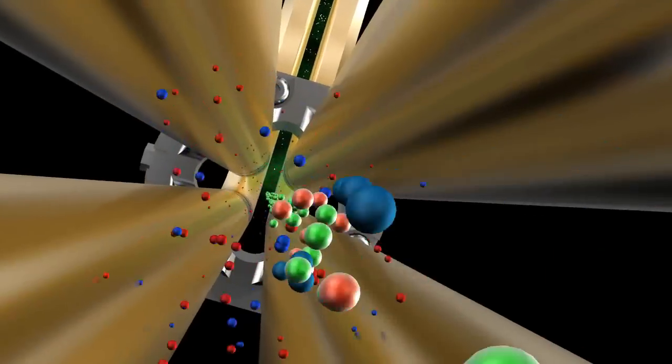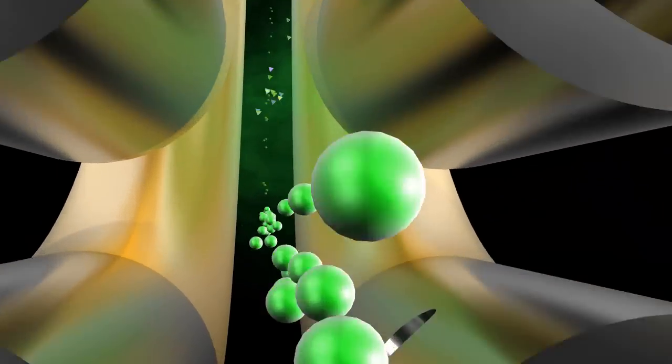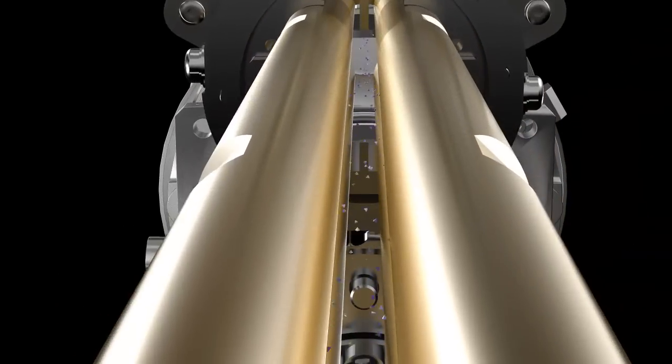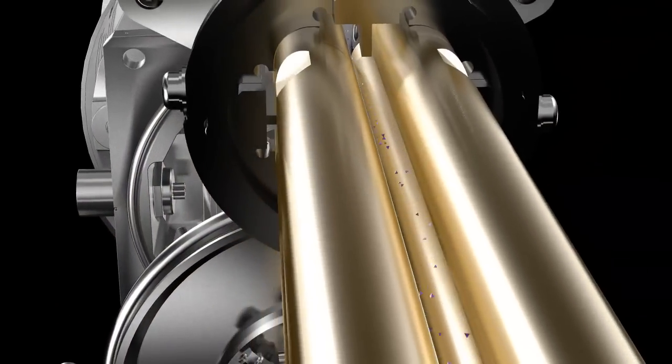Following parent ion selection in Q1, the newly designed curved LINAC collision cell generates true database-searchable fragment ions and accelerates them into Q3 to eliminate crosstalk.